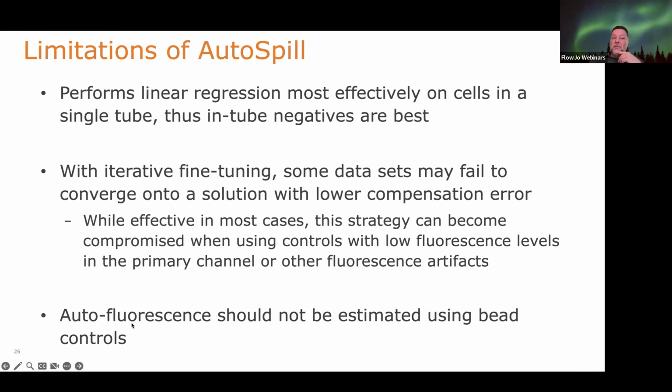And of course, autofluorescence cannot be calculated on a bead. It's completely different autofluorescence levels than your cell populations. So always use cells, unstained cells of the exact same type that you're most interested in in the system, to remove autofluorescence.